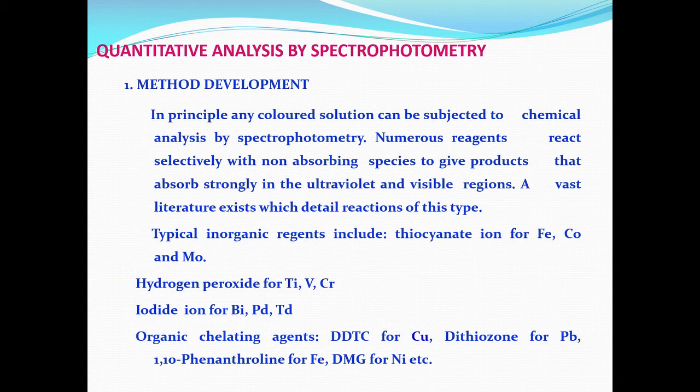You can use it for quality control, measuring the absorbance of a Fanta or some other drinks, food and beverage applications, etc. But the spectrophotometer basically covers quantitative analysis. So, how do we go about doing the quantitative analysis using a spectrophotometer?